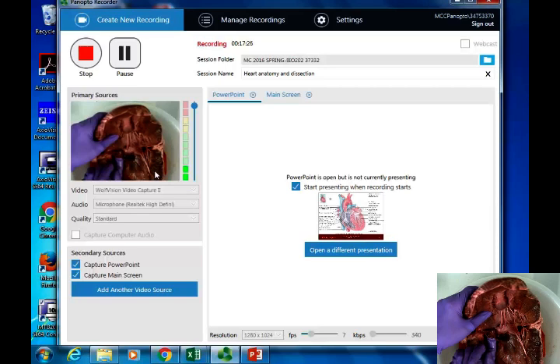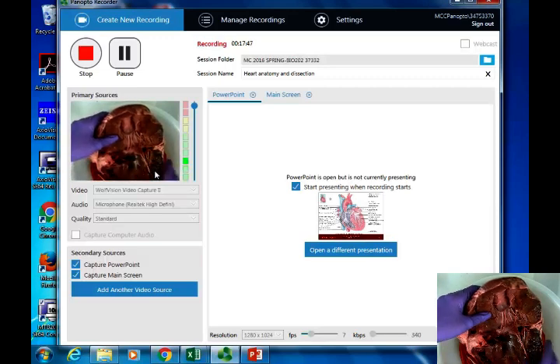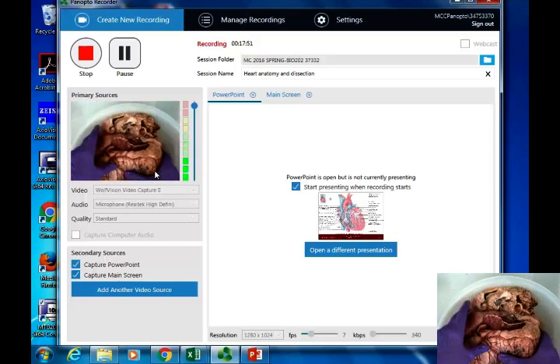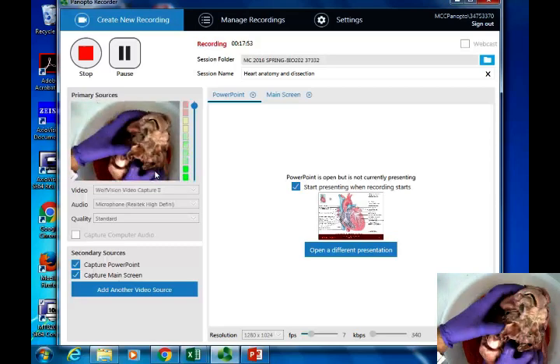When the wind gets underneath your umbrella, it tends to move it. When the blood tries to come back into a chamber, it catches in these umbrella-shaped cusps and pulls them down and closes the valve so that the blood can't come back into that chamber. So the shape of these is what allows those valves to actually move and do their function of creating a one-way movement through the heart. Okay? So, again, just more demonstrative for the big cow heart here.